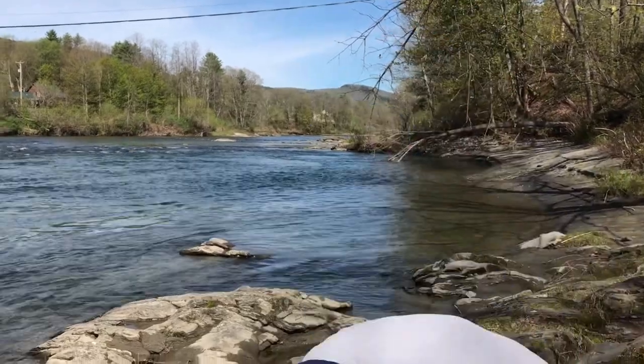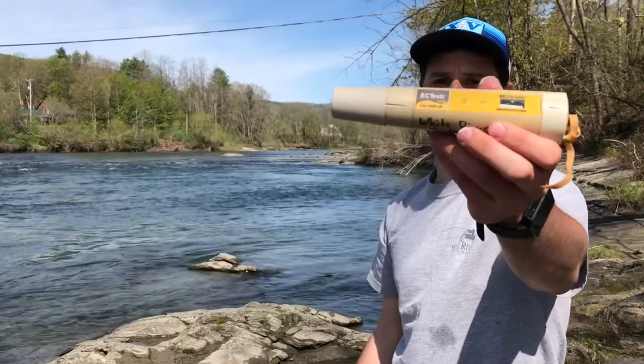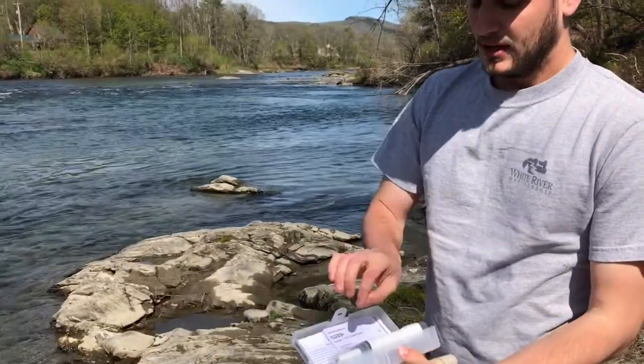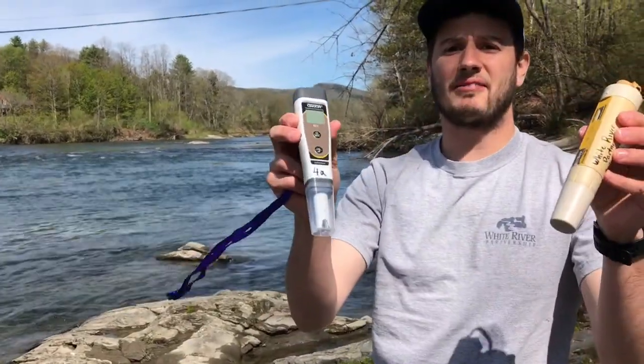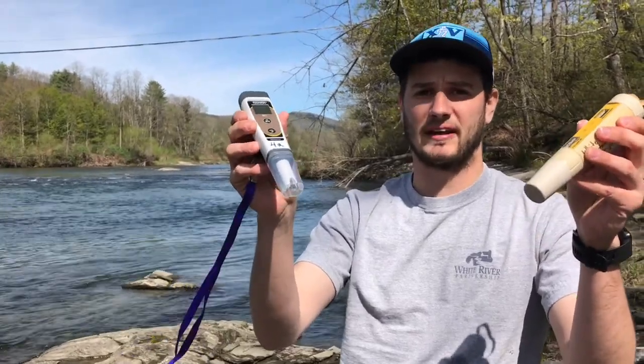There are two different conductivity pens that a volunteer might have. You might have our EC tester or you might have our Oakton pens. Before you get down to the water, make sure you know which kind of pen you have and make sure you know the instructions on how to use each pen. I'm going to show you how to use both today.